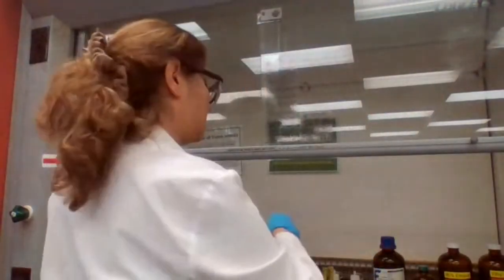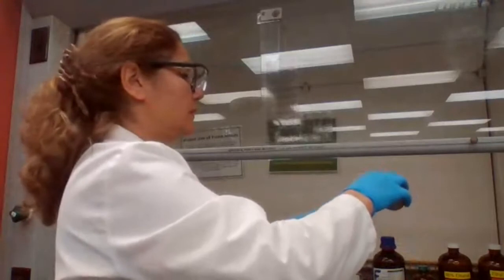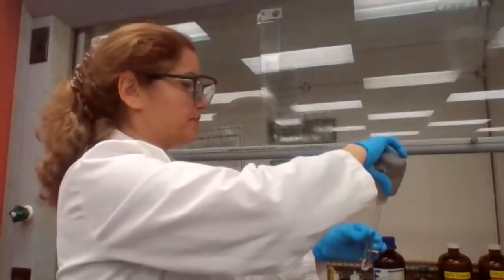Silver nitrate. How many drops? 2 milliliters. So 2 milliliters is about 40 drops.